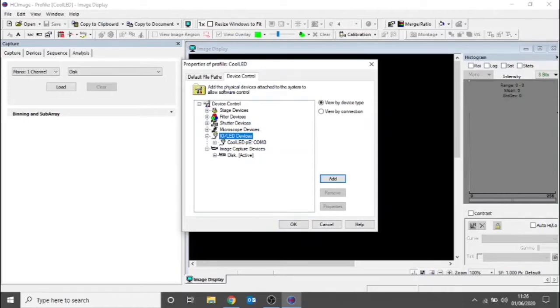In this demo, we'll be using a simple board camera as our detector. This will also need to be set up. Without a camera attached, the capture section of the software is not usable. And in this example, the board camera will remain with the lens cap on, so no images will be visible. But this is just for demonstration purposes.